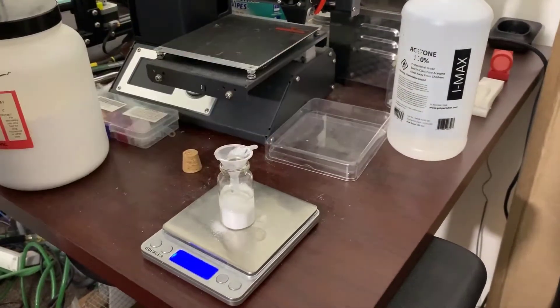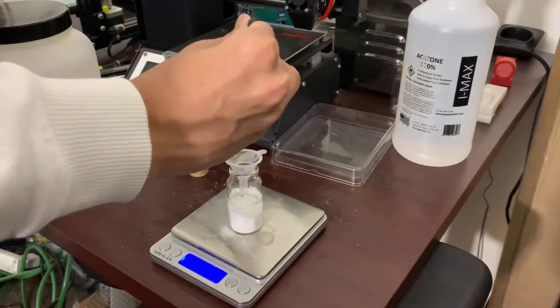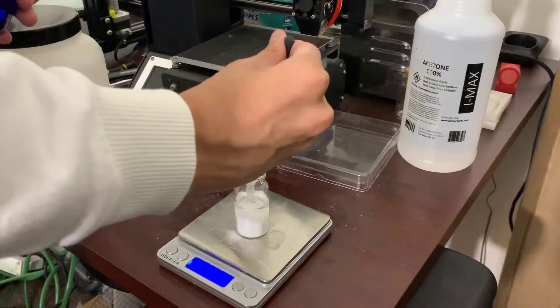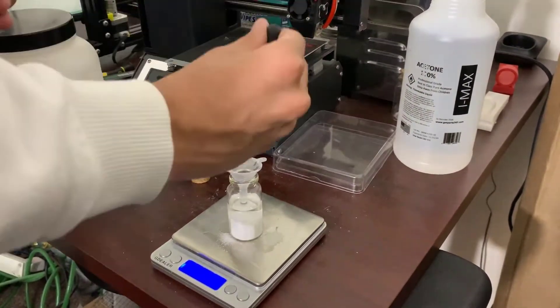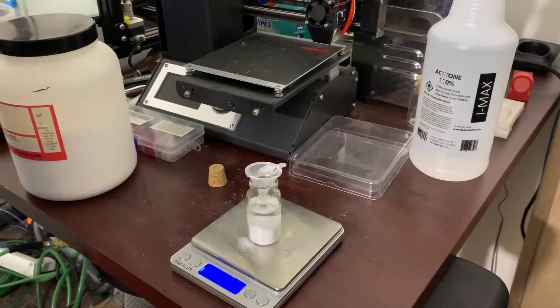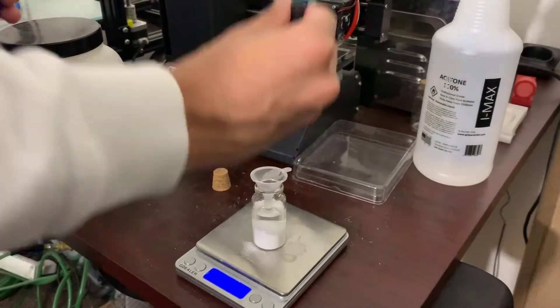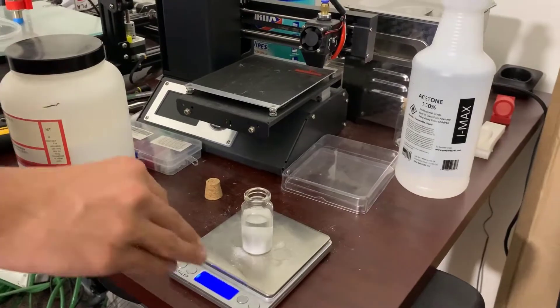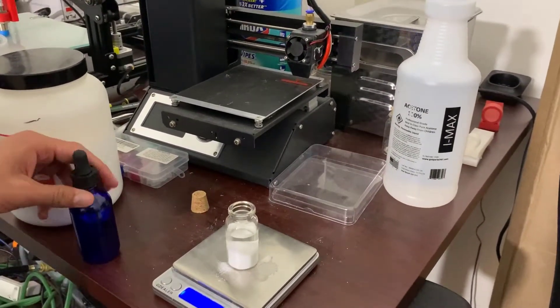You want to get about 7 grams of acetone into this solution, and the total weight of the solution should be 11 grams after you are finished. If you want to make more solution, just follow the same ratio of 4 grams of cellulose acetate to 7 grams of acetone.